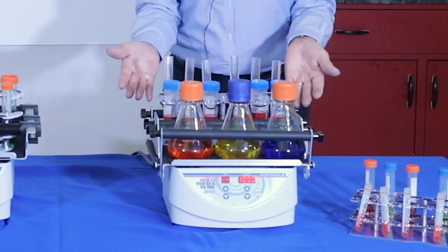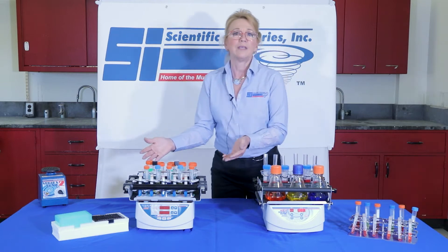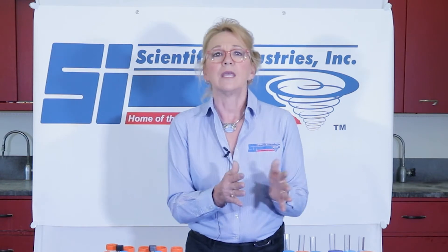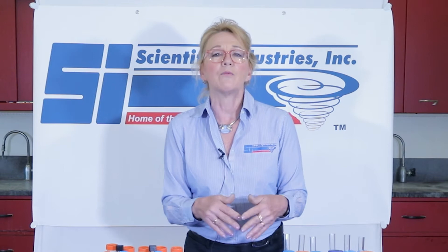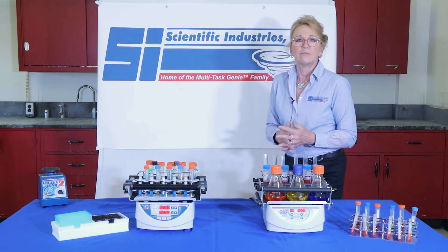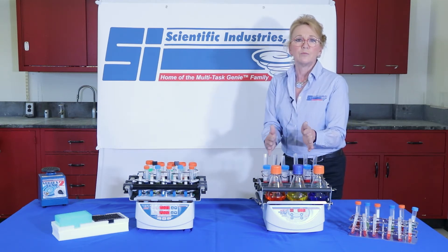Here we have the Multi Vortex Genie and we have the Vortex Genie Max. The primary difference between these are the diameter of the orbit and the speed at which they can maximize. So depending upon the application and requirements, that's how you choose which one would be best for you.